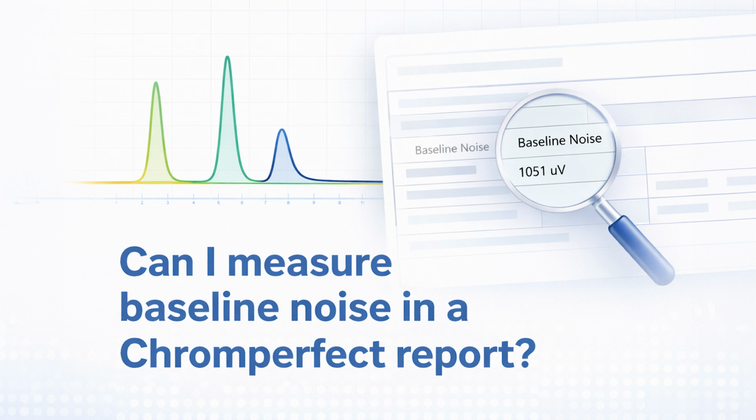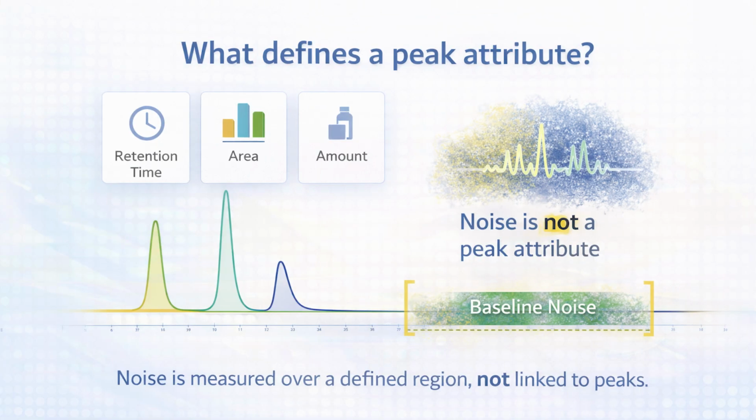In this video, we're going to answer a common question. Can I measure baseline noise and include that measurement directly in a formatted report? To answer that properly, it's important to understand how Chromperfect approaches reporting and calculations, especially for values like noise that are not tied to individual peaks.